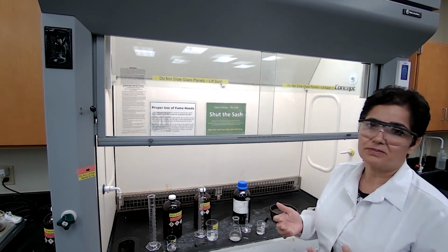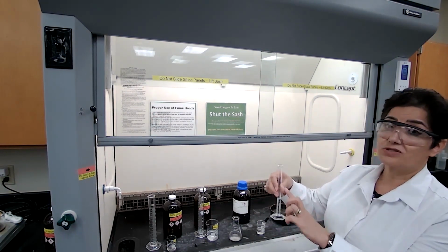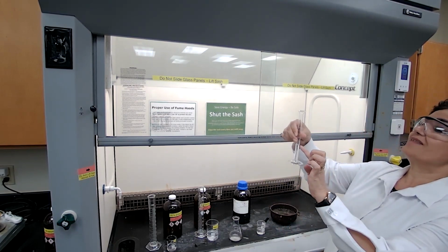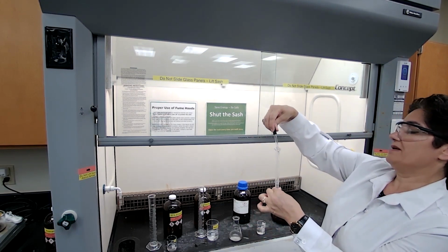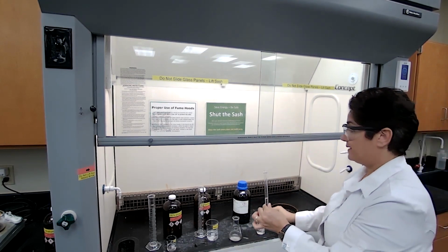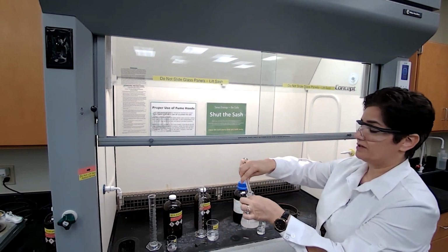Second, it is an excess compound, so we can comfortably use a graduated cylinder to measure it. So we are going to measure 4.7 milliliters of the benzaldehyde. I just want to bring it to the volume to make it 4.7 milliliters, and pour that into our solvent mixture.